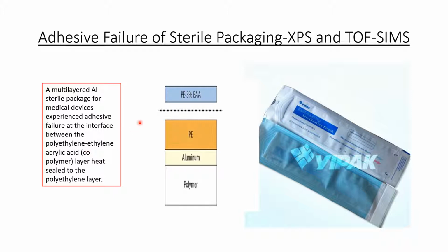The next example is the adhesive failure of sterile packaging using both XPS and TOF-SIMS. A multi-layered aluminum sterile package for medical devices experienced adhesive failure at the interface between the polyethylene ethylene acrylic acid copolymer layer, which is heat sealed to this polyethylene layer.